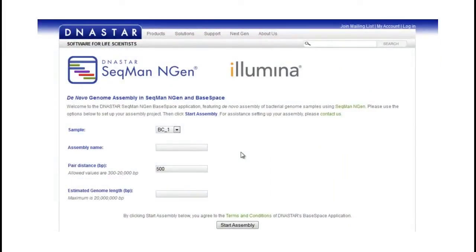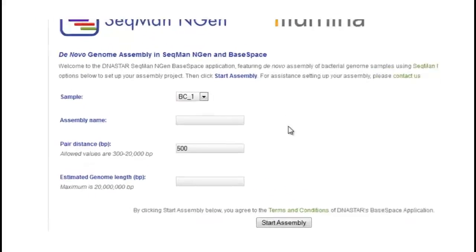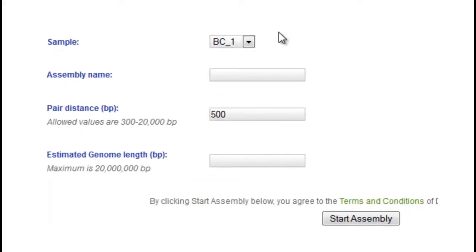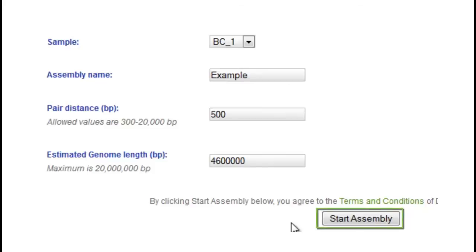Looking at our freely available de novo bacterial genome assembly application, we can see that you can quickly and easily set up your assembly by entering in some basic information about your project, such as the Illumina sample you are using, the assembly name, the pair distance, as well as the estimated genome length. After these short steps, simply click Start Assembly, and SeekMan Engine will create a BAM file and a SeekMan Pro project for you to use in either DNA Star Lasergene or another BAM viewer.